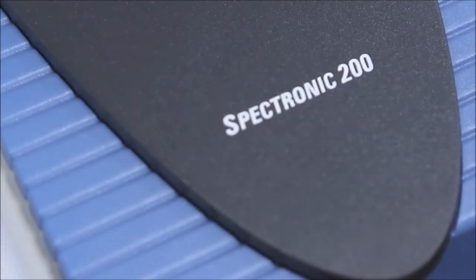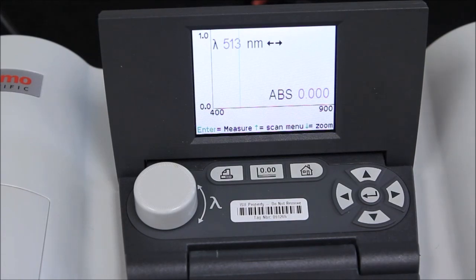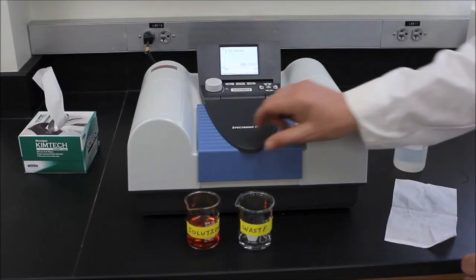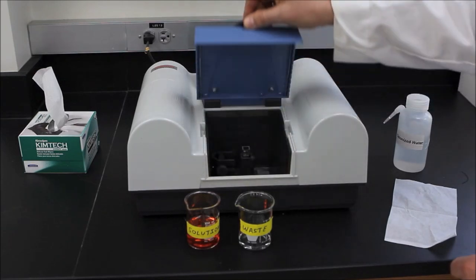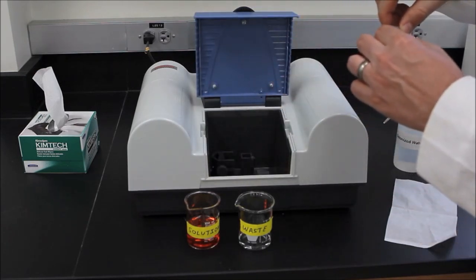After closing the sample compartment, press the zero button. When auto zero disappears from the screen, you may remove the cuvette from the cuvette holder and pour its contents into the waste container.